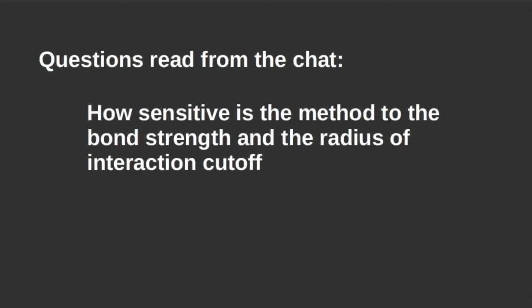So that's why I spoke quite a lot about the cutoff radius, and this is why we have two methods. One is to set the value externally if you see that there is some problem, like you have a few atoms that are moving isolated from other atoms.